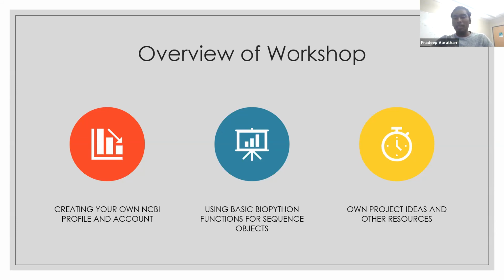Then we'll jump into basic BioPython functions. If you do not have any idea about Python or programming at all, it's cool, because I'm going to give you a really short introduction to the basic data structures present in Python and the basic loops. I'm not going to go deep into those; it's really extreme coding. We just need to know that if you use this function, you get this biological pathway or method done. If you have any doubts, even about basic Python, you can always interrupt me and ask.